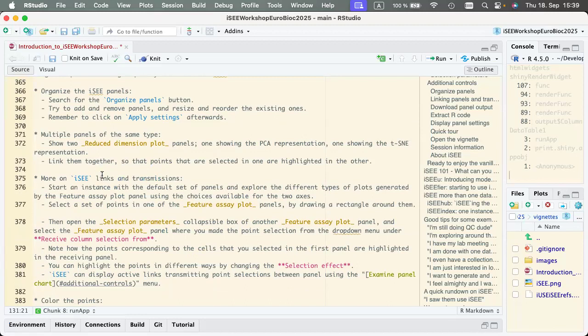Not a question, but if you could demonstrate something for me. Yes. Because I was stupid enough to pack this instead of a laptop. So okay, I can try on my own. One of the most common operations I perform is when I cluster, I try to plot the mean reads per cell. Mm-hmm. Sorry, I'm not really clustering. It's okay. Just to see if the ones which aren't being clustered properly have far fewer reads. Mm-hmm. So I think that should be possible with iSEE with a separate plot. Okay.